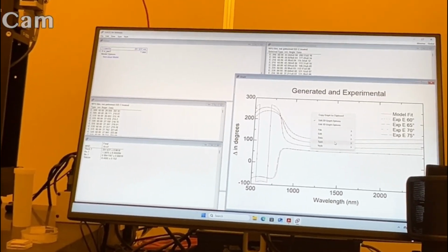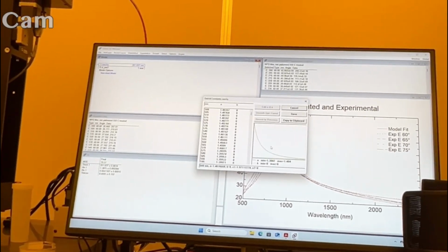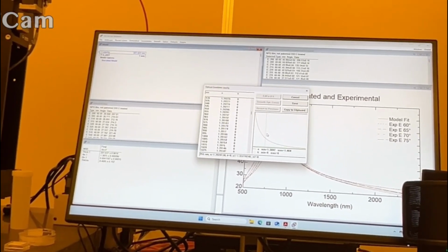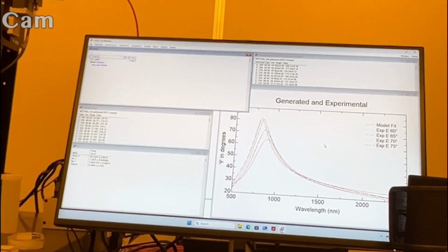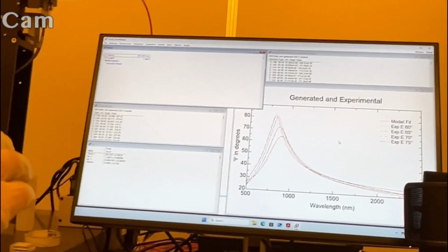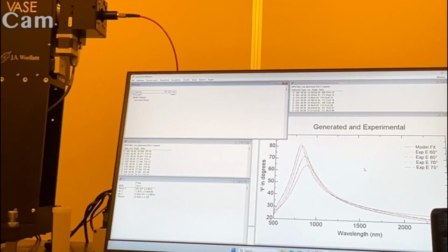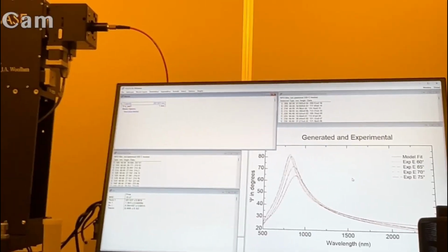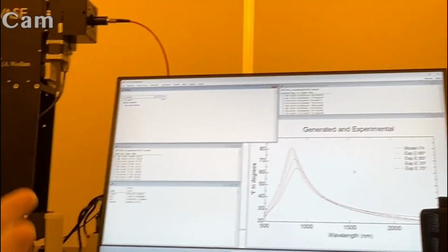So regardless, it's around 200 nanometers, and your index wants to be in this spectral range, around 1.4. Okay, because you said this was porous, right? I think it looks like it's completely collapsed. What were you normally getting for an index? For a porous film, we can go down to 1.19 to 1.2. Oh, that's really porous then, yeah.